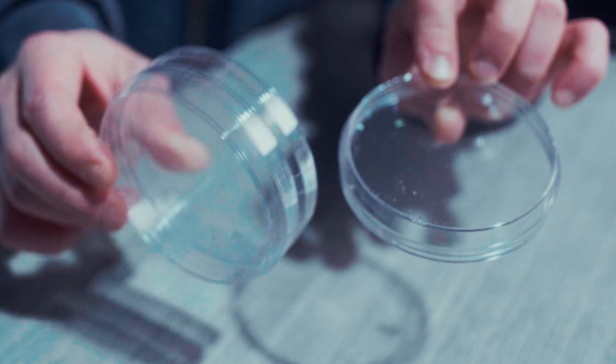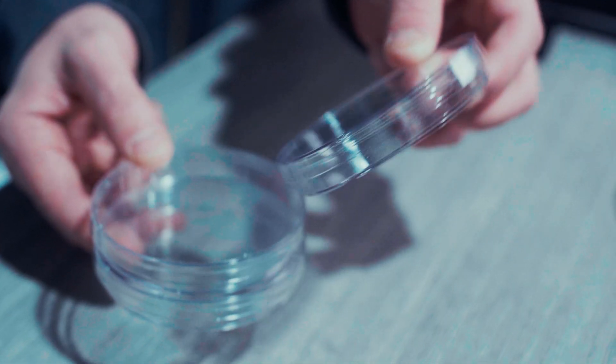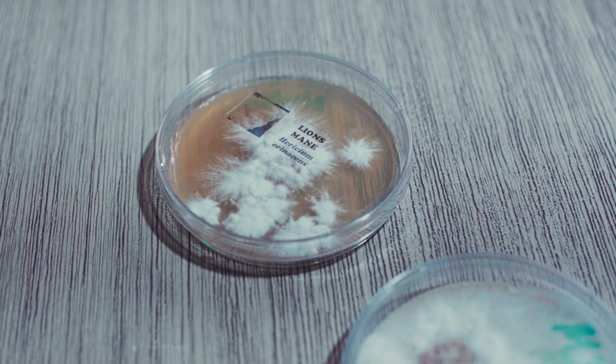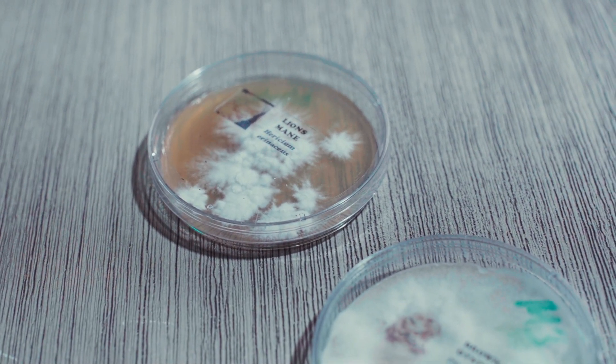Why would you want to use petri dishes on your mushroom farm? The purpose of a petri dish is to filter out three-dimensional growth of the organism down to a two-dimensional layer. This allows the farmer to observe the mycelium and to check if there are any contaminants in the culture.